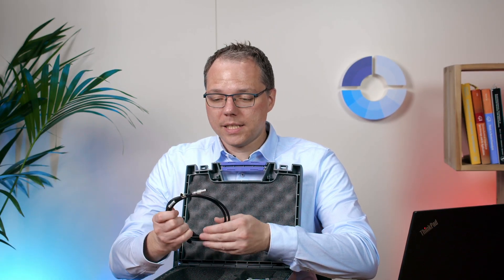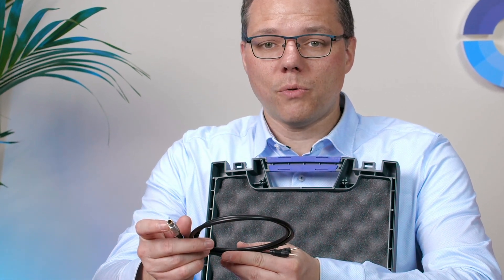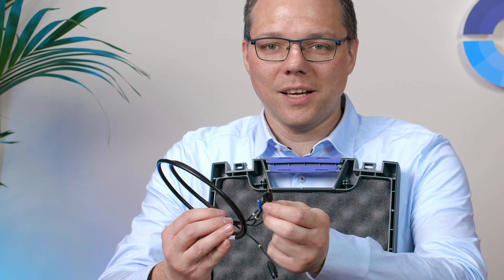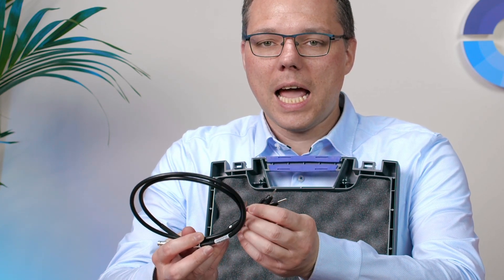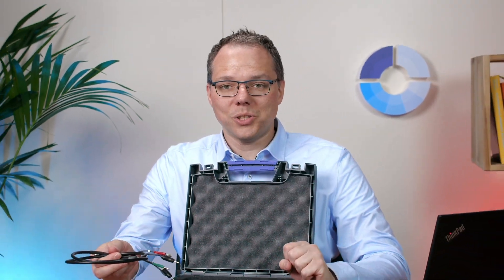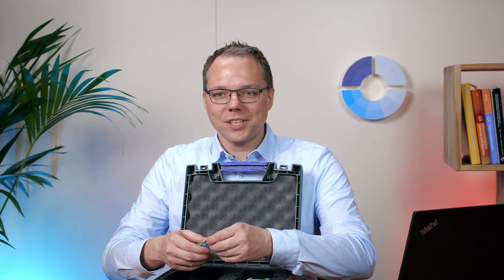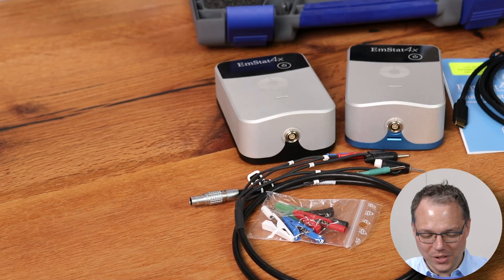Then of course you will find a cable to connect your electrodes. It's our usual cable with the round plug at the front and two millimeter banana plugs. The cable for the high range version of the EmStat 4X also has a sense lead, which is very important to always connect when you do your measurements — usually you connect it to the working electrode. You also have matching crocodile clips for your cable.